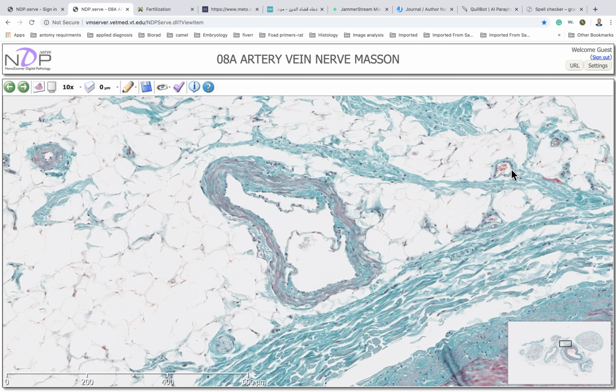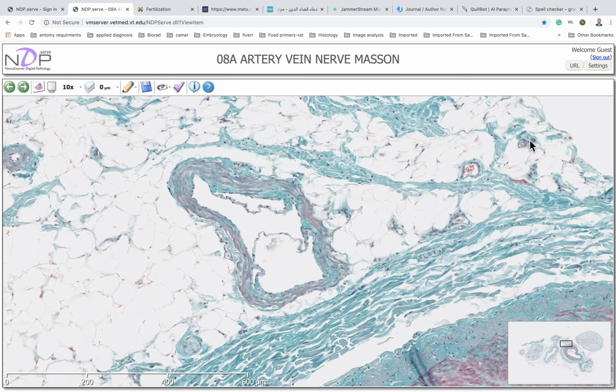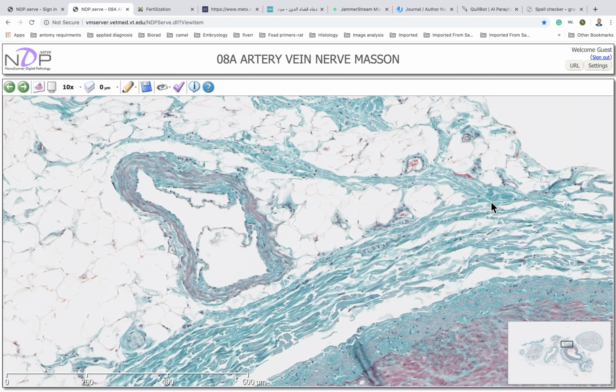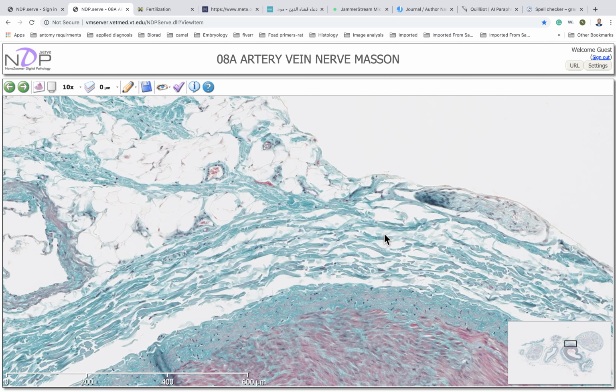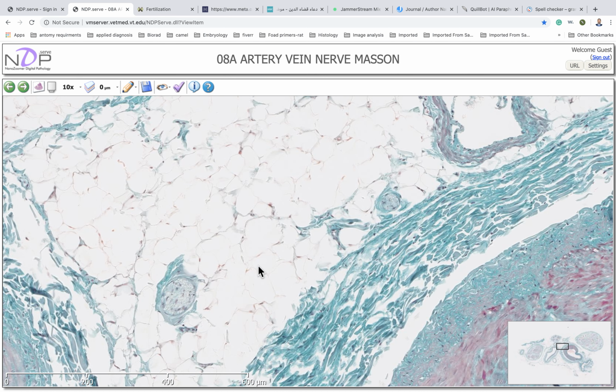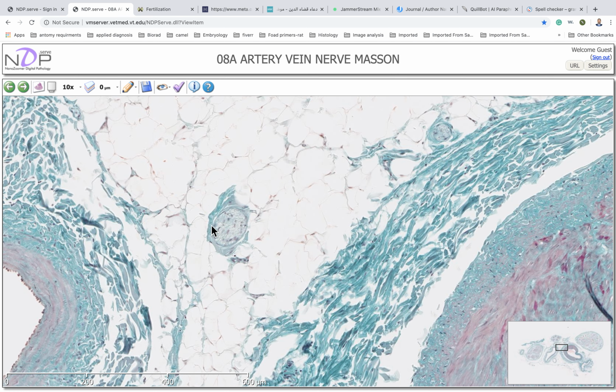And the small structure here, again, this is a venule. But here, where we have just only the simple squamous without adventitia, most likely this will be a capillary. Here we can see this is a nerve, this is the axons, and this is the perineural connective tissue, the perineurium, and this is the space, which is the perineural space where we have the cerebrospinal fluid.